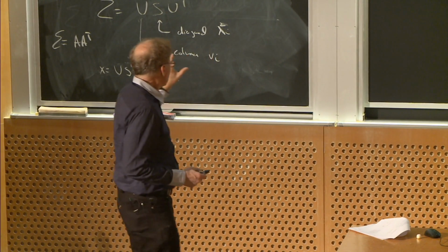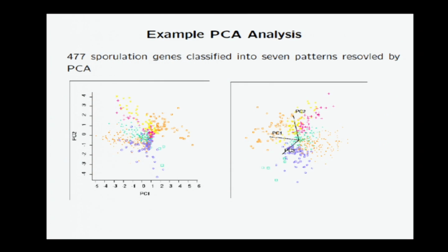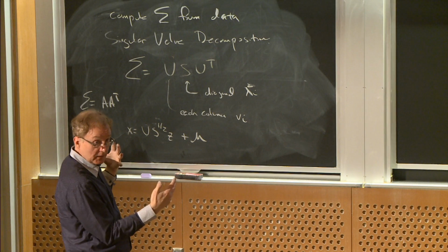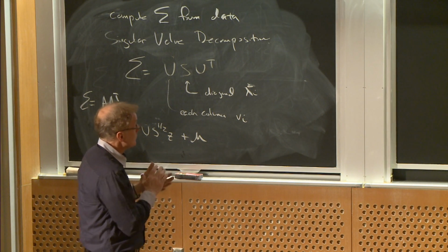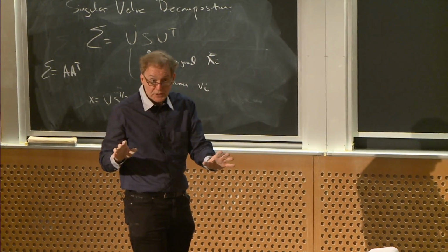Okay, so we have these eigenvectors and eigenvalues which represent the vectors of maximum variance in the underlying data. And we can use these to organize data by projecting observations onto these eigenvectors, or they're sometimes called principal components, to find dimensions of variability that help us organize our underlying data. We'll come back to that in a moment. Okay. Any other questions about principal component analysis?